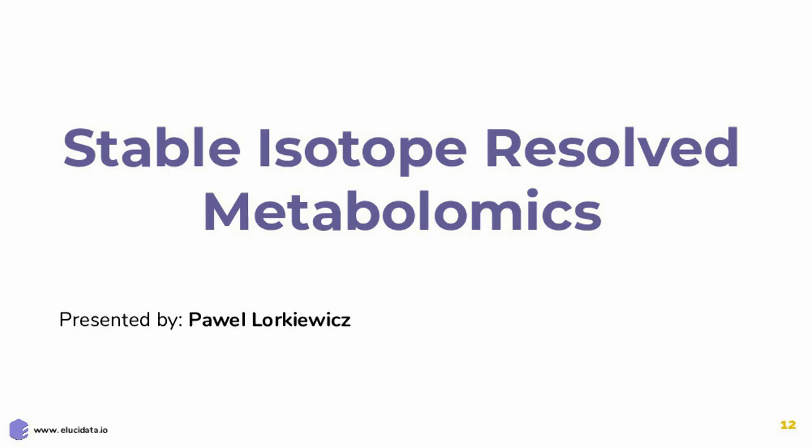My name is Pawel Lorkiewicz, and I will talk about stable isotope resolved metabolomics and present a demonstration of the El-Maven and Poly workflow with the data that we acquired and show you how we process the data and how we can get from raw output to actual analyzed data in minutes.